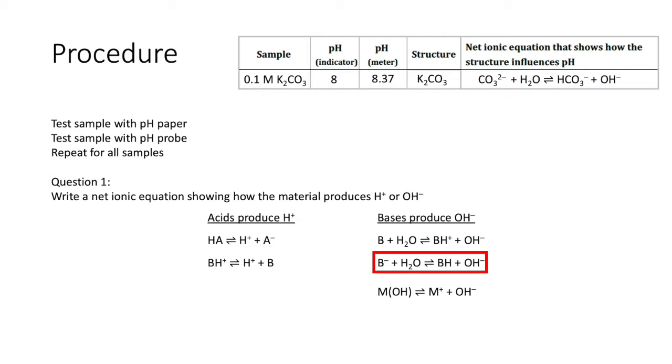The second post-lab question asks you to develop a list of pros and cons for using pH paper and pH meters. And when you're making this list of pros and cons for the two different methods, remember that you are in a laboratory course, which is inherently practical. So not only do you need to think about things like measurement, precision, and reliability, you also need to make very practical considerations like portability and cost and training requirements and things like this.